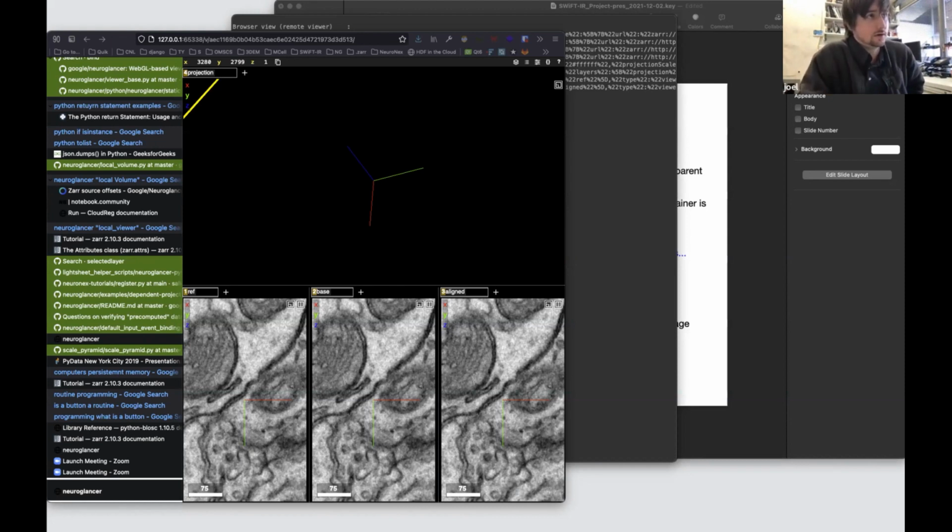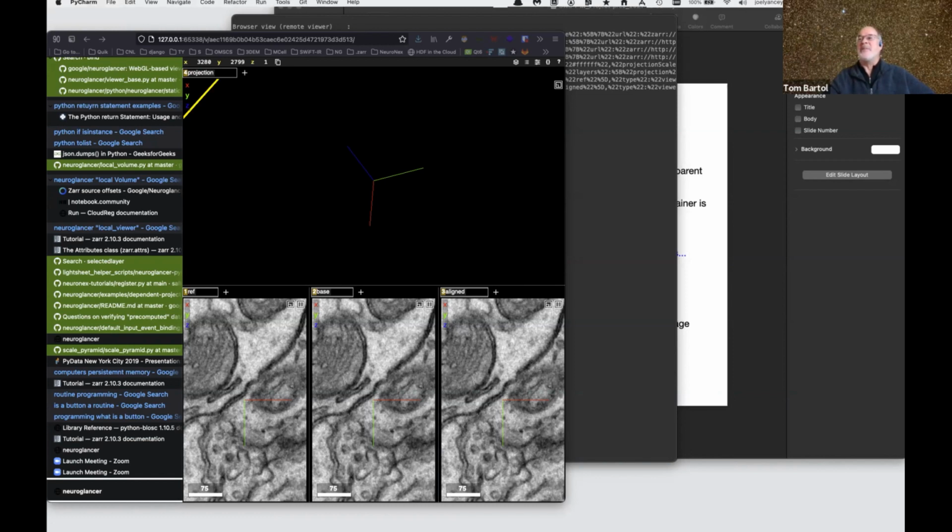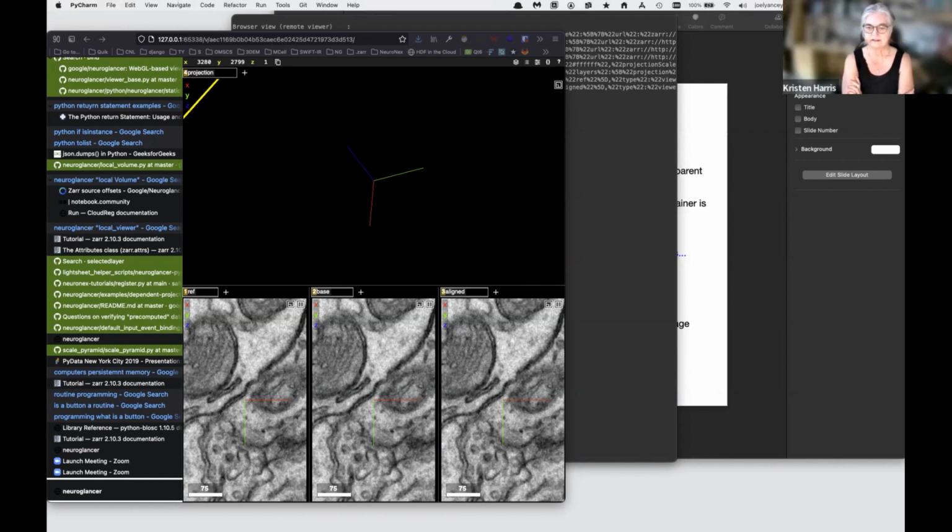And here too with NeuroGlancer. Yeah, and the image display in QT doesn't have that capability. Is that right? Mm-hmm. So this is why we don't have good performance when we have the scale 1 images in QT in alignEM-SWiFT. The team has complained that when they go to scale 1, they can't really scroll through. That problem goes away when we have NeuroGlancer. That's fantastic. That's great. At our fingertips, yeah.